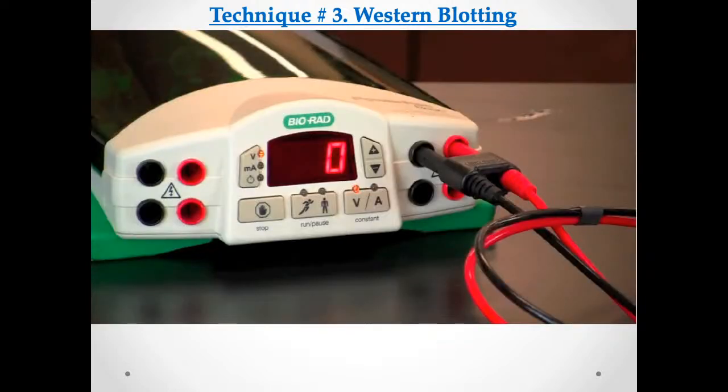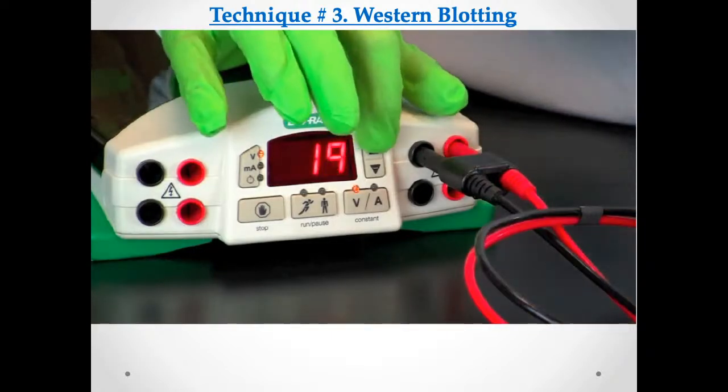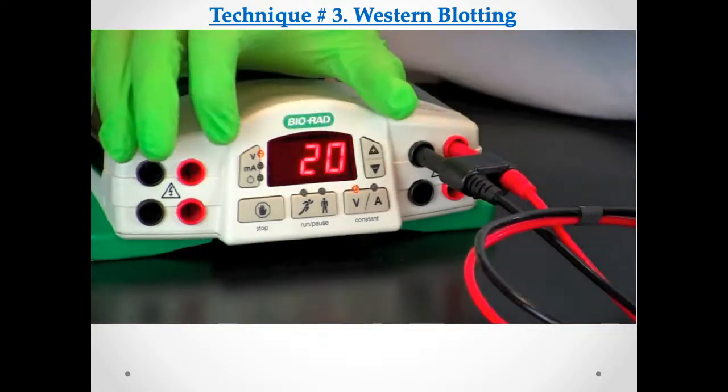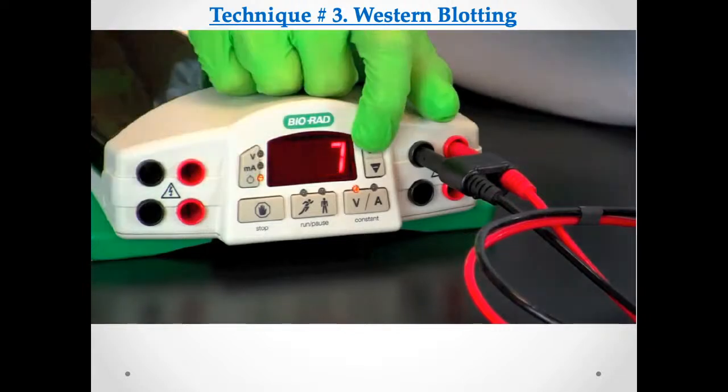Connect the electrical leads to the power supply, making sure the connections are correct, red to red and black to black. Turn on the power supply and run the blot at 20 volts. If a timer is available, set it for 2.5 hours.